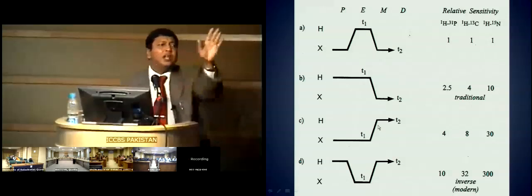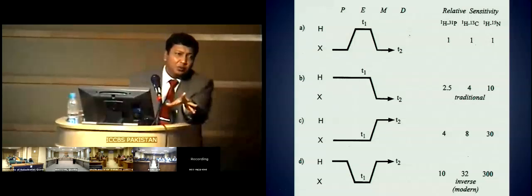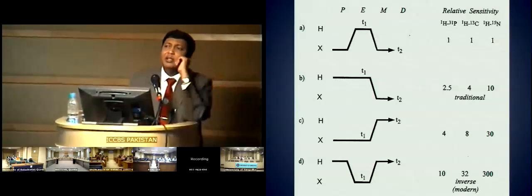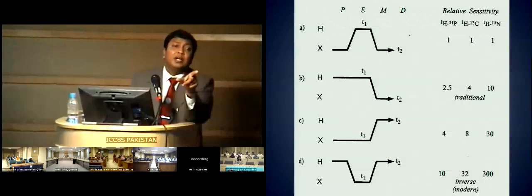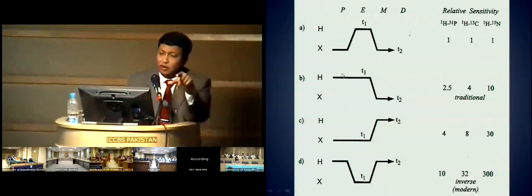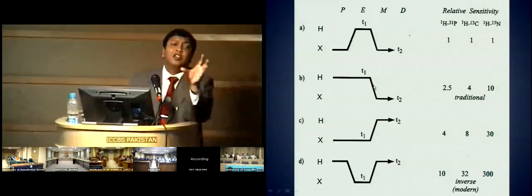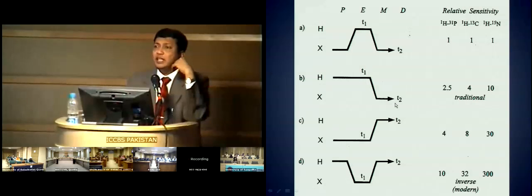Remember, carbon, you bring the carbon with a 90 pulse, this carbon is split into two parts, it goes antiphase, and then you give a 90 pulse, it goes to plus Z and negative Z, and it mixes with the proton, right? Because proton, remember, you didn't really bring to the XY plane yet. As you have not really brought the carbon to the XY plane in INEPT until it is reinforced and polarization transferred. Then you bring it to the XY plane and then you detect it.